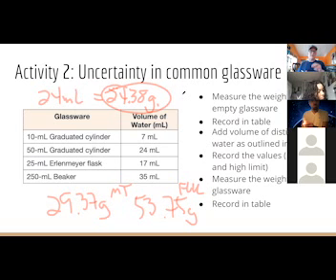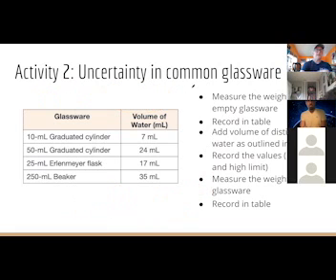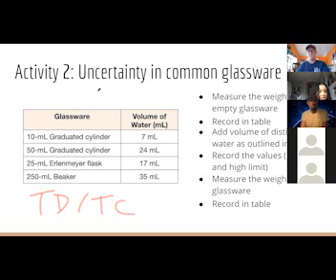Well, we know what the 20 degrees C means. What do you think TD and TC means? TD, TC. Density and something with density in Celsius. No, that's a good guess though. So we know what the temperature is. It says T, so I'll give you a hint. T stands for 'to'.